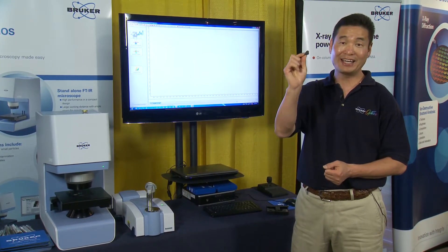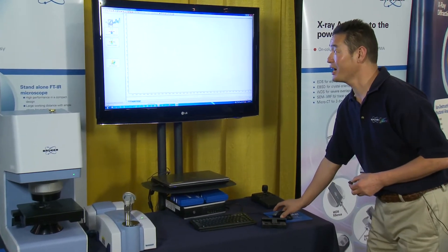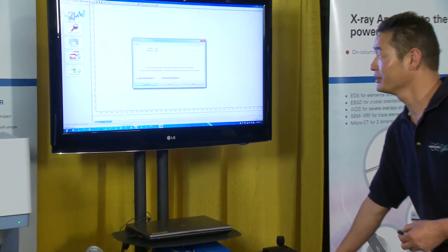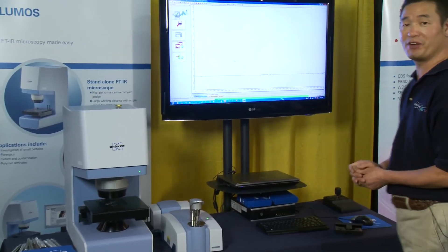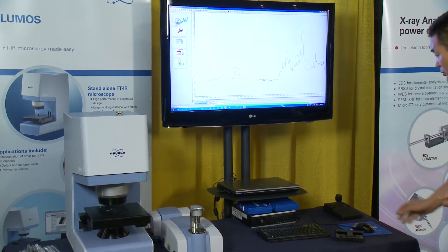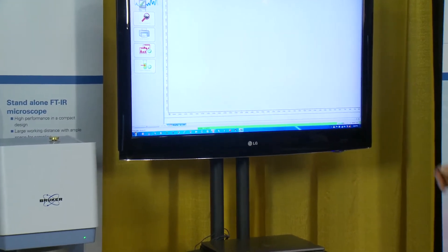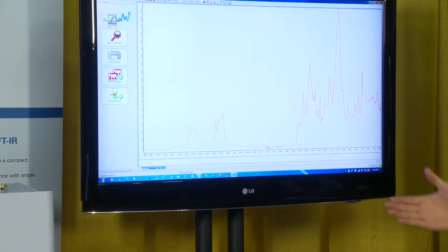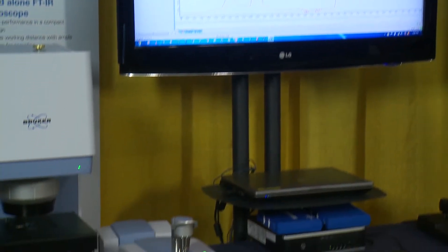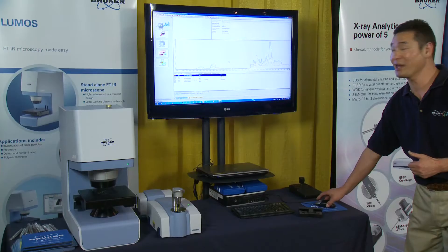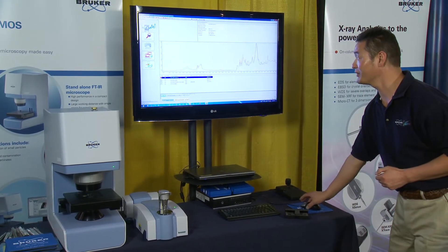I can easily scan the infrared spectrum and then search the library. Here is a demonstration. I start with 'measure sample,' give it a name, and start the measurement. Now I'm going to put the sample over there, press it down. You will see a preview coming up shortly — and a nice-looking preview. Now scan to get a high-resolution, high-quality spectrum in a couple of seconds. Here is the spectrum of this material. The FTIR spectrum acts like a fingerprint of this chemical — it's very unique. Once you have the fingerprint, you search the infrared library and you get a match. See how good the match is? Every peak here matches, and it says the material is polyurethane.